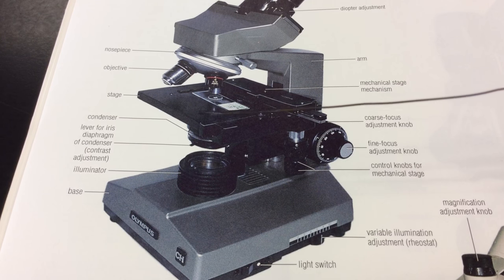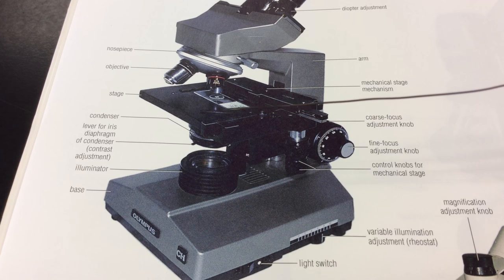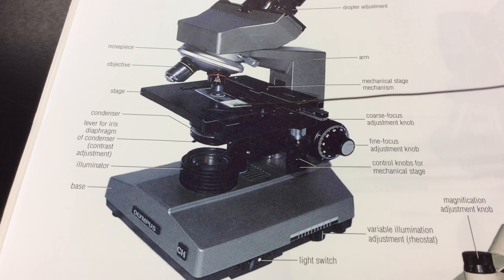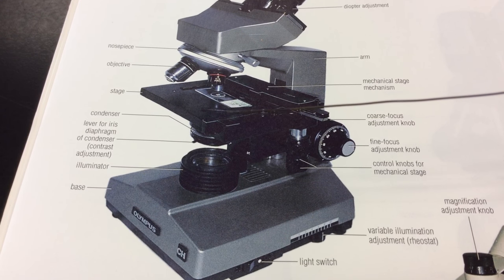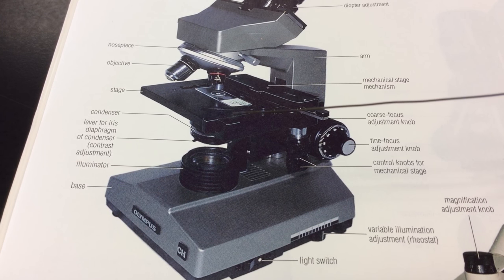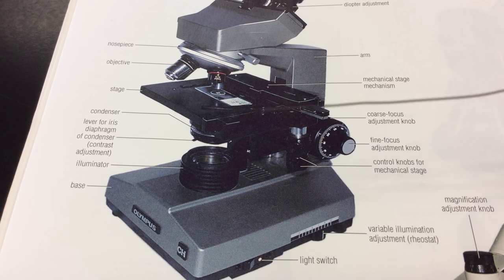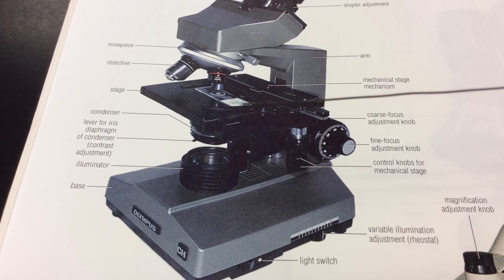Now, the microscope slide is going to be held in place by slide clips here, and we have to be really careful not to let those clips, we don't want to release them so that the clips will smack into the microscope slide. That's a good way for us to break the slides. So we want to be very gentle when we fit our microscope slides into the slide clips.